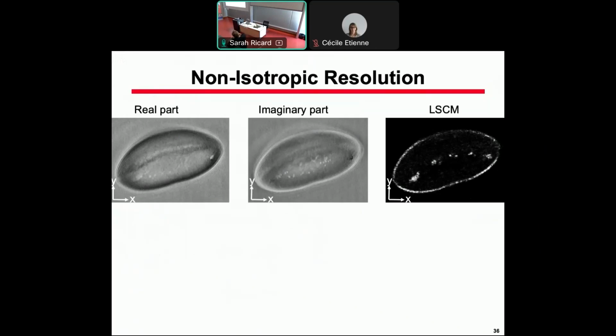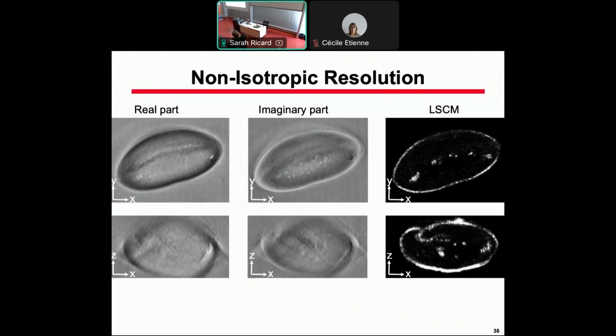Here the XY view and the confocal. So the interesting thing is you have 3 different images showing the structures are not the same. But when you go to the Z view, the confocal has nice sectioning capabilities, while here it looks like the surface evaporates.